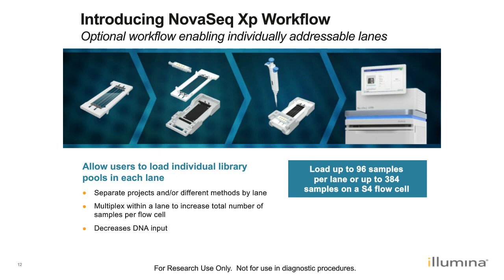And these kits will come with the flow cell manifold and a set of XAMP reagents. With the XP workflow, you will manually set up the XAMP. When the library pools are mixed with the XAMP reagents, they're manually loaded onto the flow cell lanes via the dock and the manifold. Once the samples are loaded, the flow cells should be moved to the NovaSeq and the run started within 30 minutes, as the XAMP is fairly time sensitive. The XAMP reaction is very efficient, and unregulated it can cause a decrease in quality for the run.